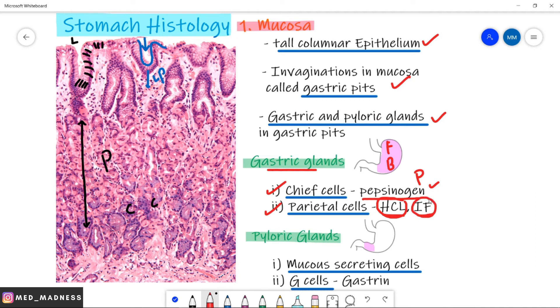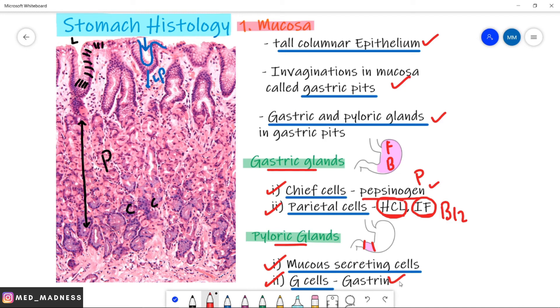What is the function of the intrinsic factor? B12 absorption. The pyloric glands, which are mainly present in the pylorus of the stomach, have abundant mucous-secreting cells. Note that you have mucous-secreting cells all over the GI tract, but they are very important in the pyloric glands because they protect the stomach wall from acids. Number two is the G cells. The G cells secrete gastrin, which is a very important hormone that stimulates the parietal cells to secrete acids. So if gastrin increases in the blood, acid secretion is going to increase from parietal cells.